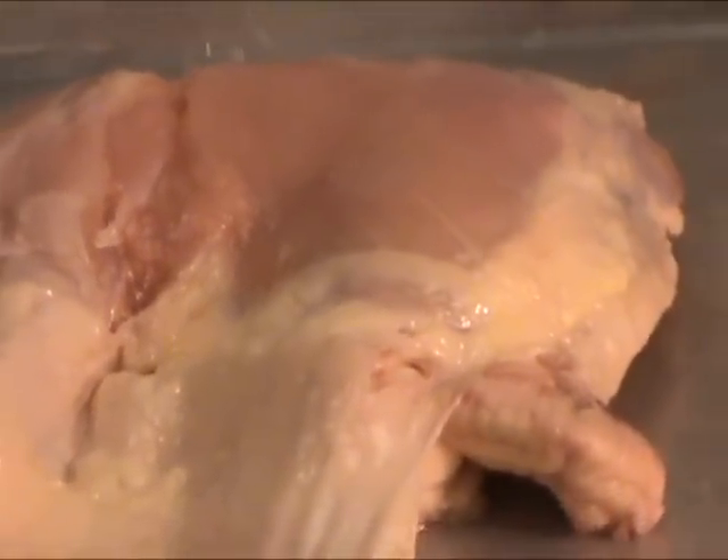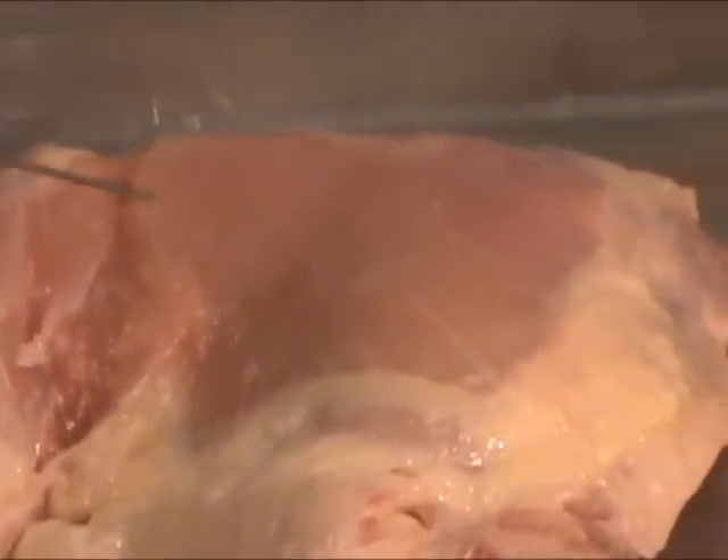If we shift our attention to the muscle tissue, the muscle is contained by membranes, just like other structures we've seen so far. As I reflect the membrane, you see the outermost membrane, or the epimysium, covering the entire musculature of the chicken leg.